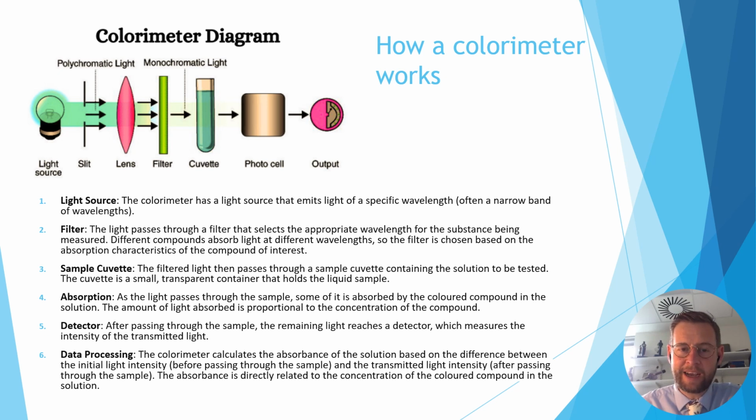That light would be allowed to go through the cuvette containing the chemical. As that chemical undergoes a chemical reaction and its colour changes, you could monitor the amount of transmitted light being detected on the other side of the cuvette by a photocell or an LDR, and then output that so that you can actively track the transmission of the light, an indicator of how much reaction has occurred, and even an indicator of the concentration of either the reactants or the products.